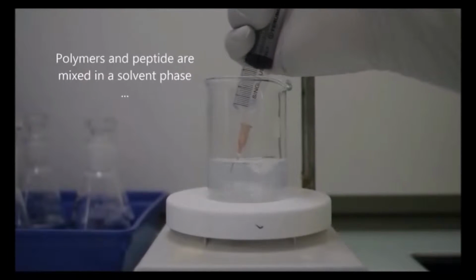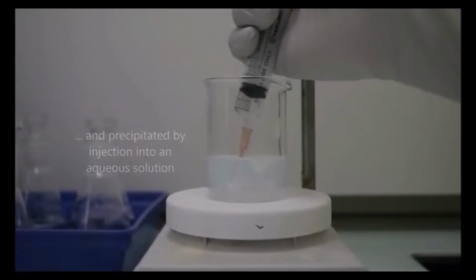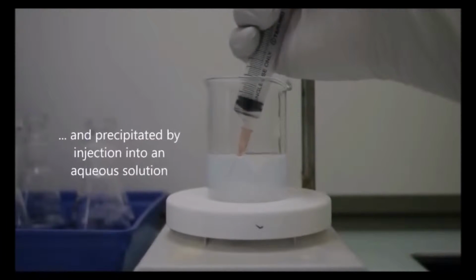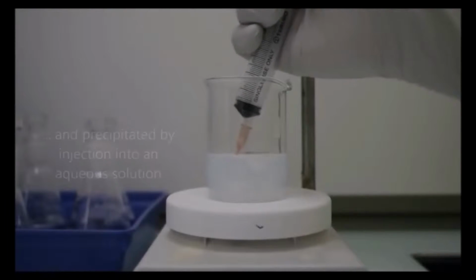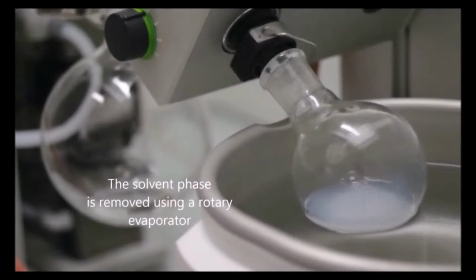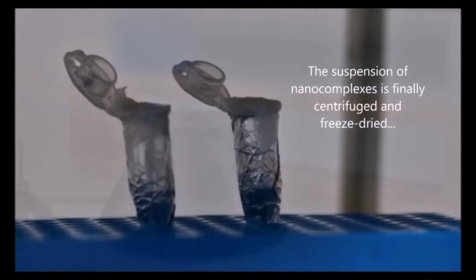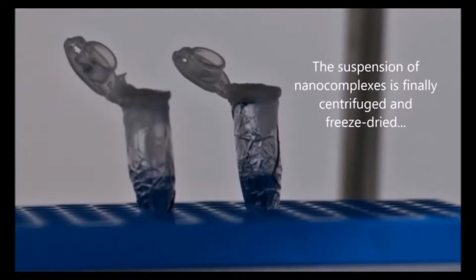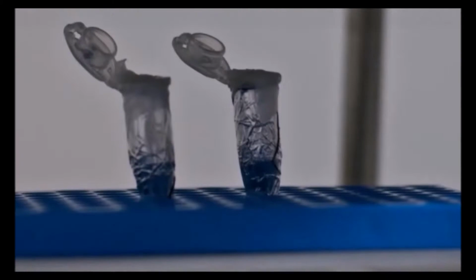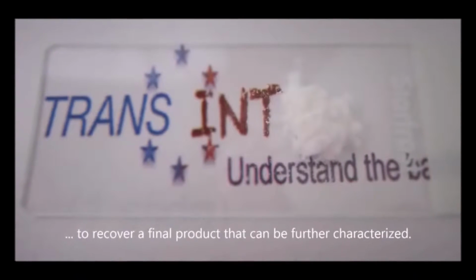Polymers and peptides are mixed in a solvent phase and precipitated by injection into an aqueous solution. The solvent phase is removed using a rotary evaporator. The suspension of nanocomplexes is finally centrifuged and freeze-dried to recover a final product that can be further characterized.